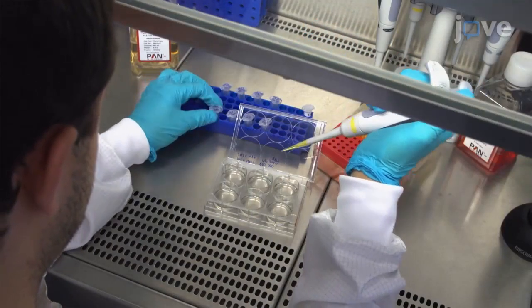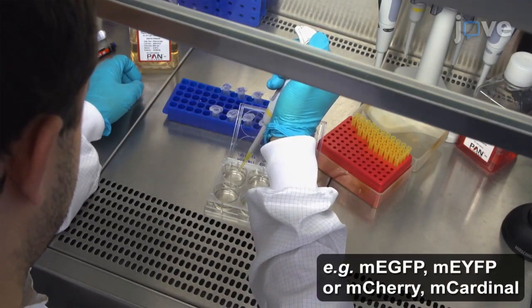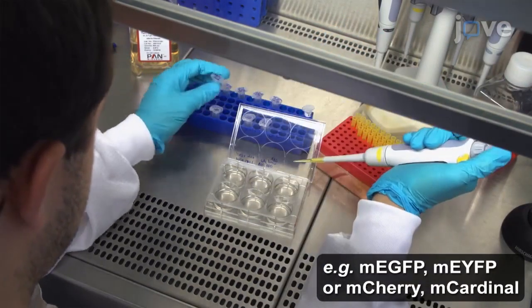To perform a basic experiment, transfect plasmids for the protein of interest fused to a green or yellow fluorescent protein and a red fluorescent protein in separate wells.